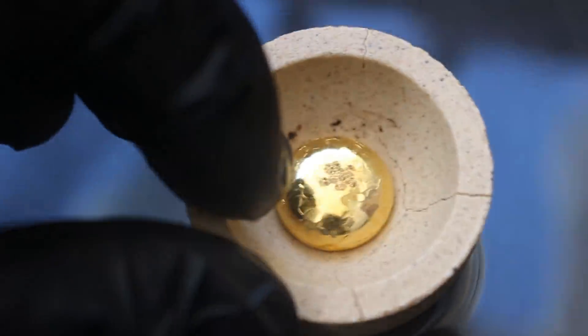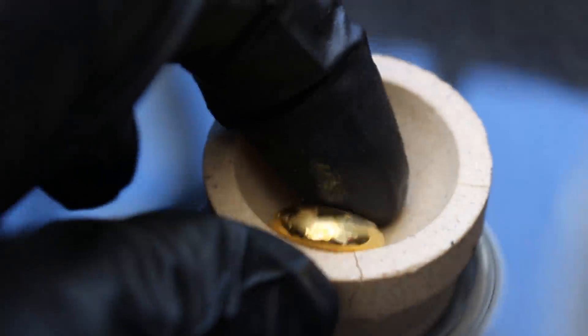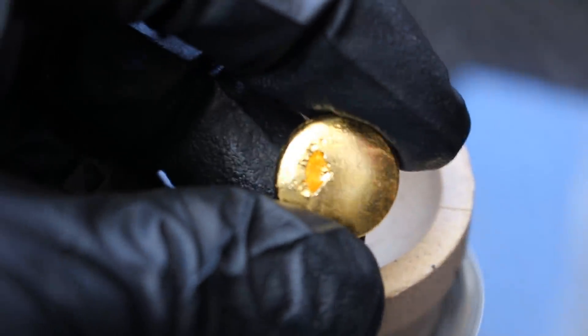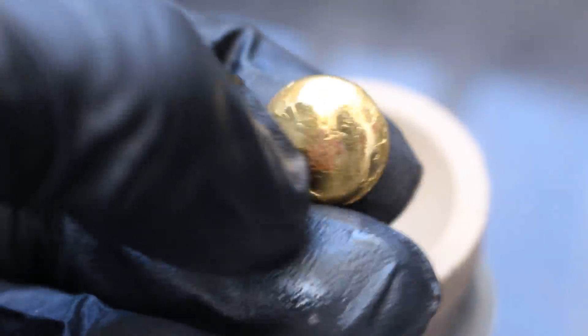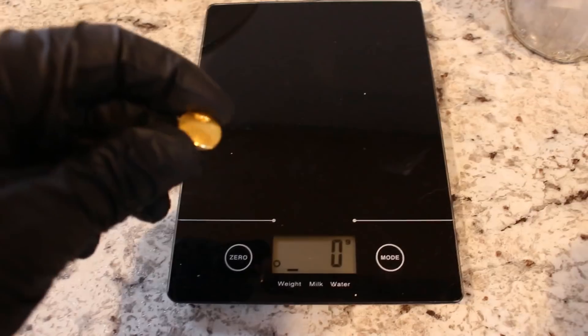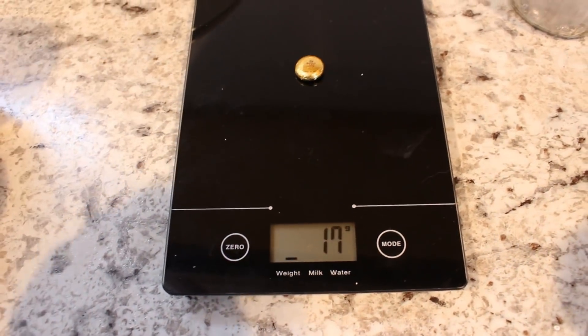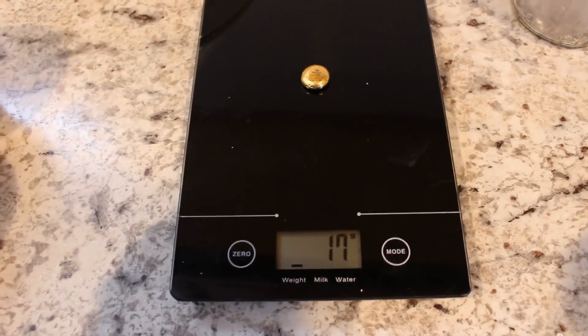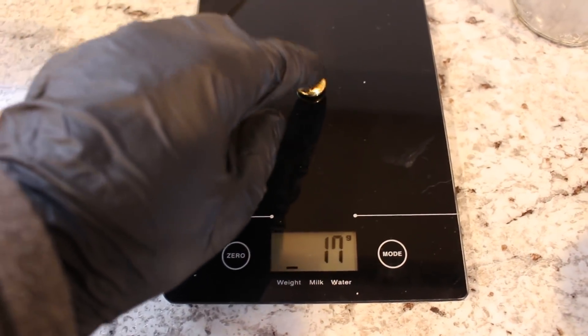Look at that. It's a shame about that little blemish on the top, but I'd say it's pretty. Oh, it's got a cavity in the back too — maybe I cooled it too soon. Let's go weigh it. Nice, fat bead of gold. Put it on the scale — 17 grams. The scale's not super accurate, so that's probably just over 16 grams.